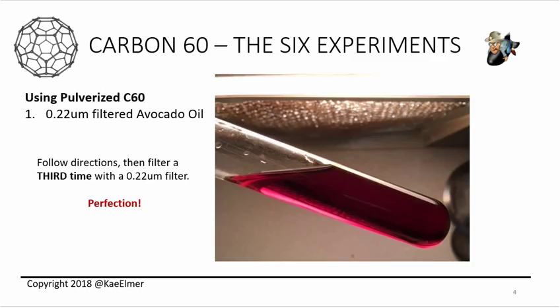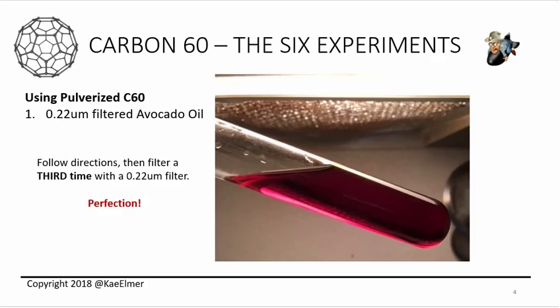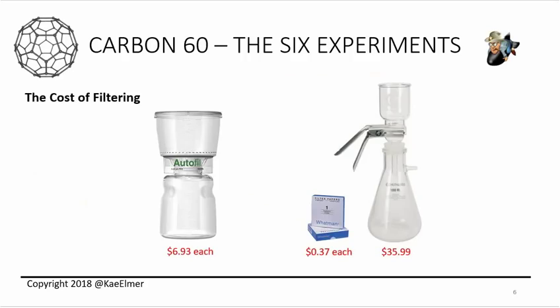So I highly recommend that for all you guys doing pulverized, go ahead and get a 3rd set of filters and filter the solution, and you'll get a really, really good product. So let's talk about filtering, though, because this is what I kind of went through, which was, I got that rig after a failed attempt with Amazon, which sent me this weird thing.